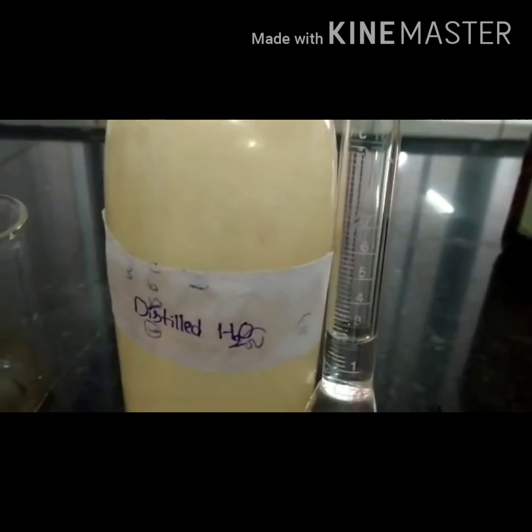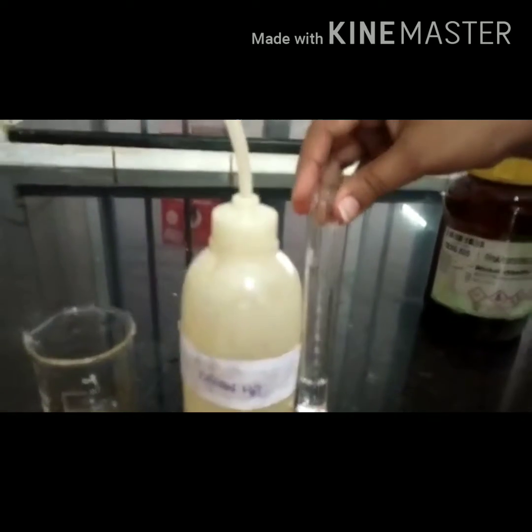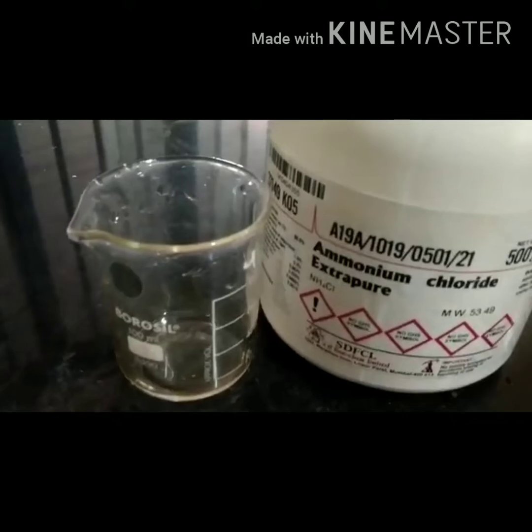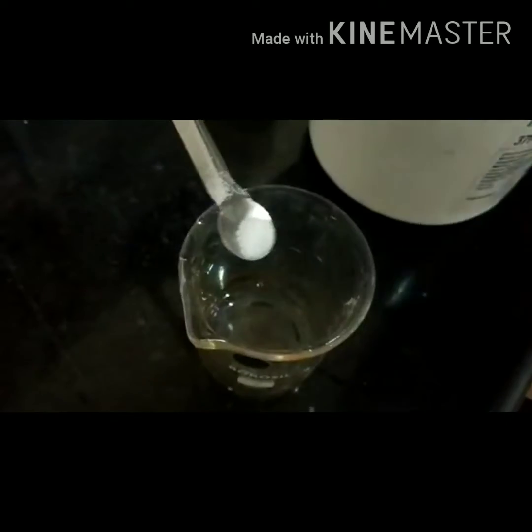Then prepare ammonium chloride solution. Measure 2 ml of distilled water and transfer it into a beaker. Add 1 gram of ammonium chloride and stir well.